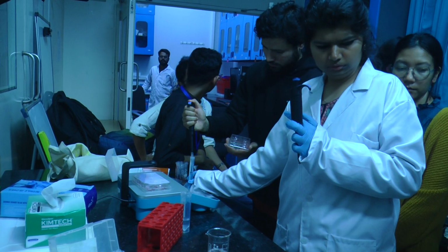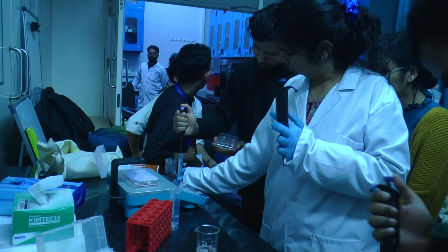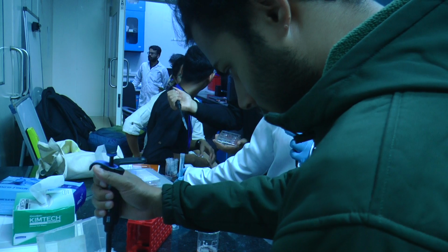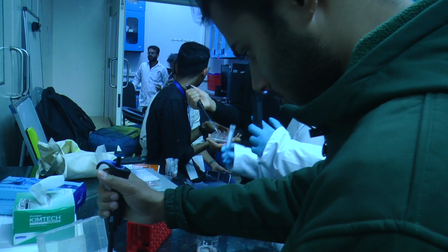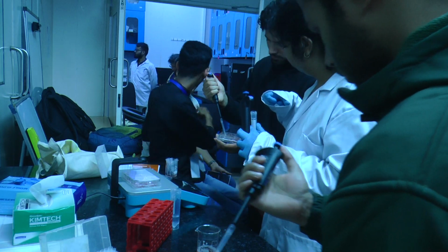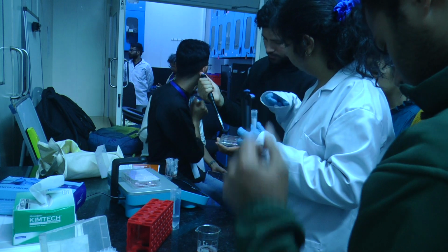Further, we want to add enzymes which cleave the lipid heads, such as PLD, the phospholipases. It's not uniformly present and will be present in only some parts of your membrane.